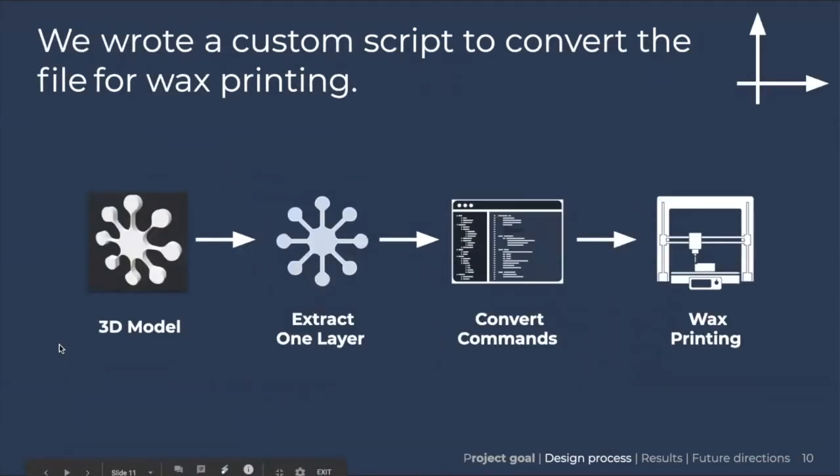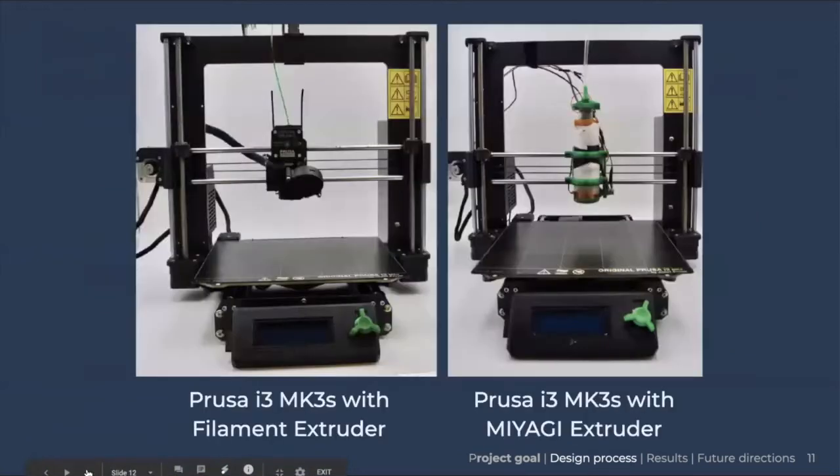In order to convert a 3D model to be wax printed, we created our own custom munging script that extracts the first layer of the g-code and changes the commands to be compatible with our printer. Here on the left, you can see the original Prusa printer that we used as a base, and on the right, the first version of our Miyagi printer. Currently we are on version two, but due to unforeseen circumstances we were unable to get a picture of it.